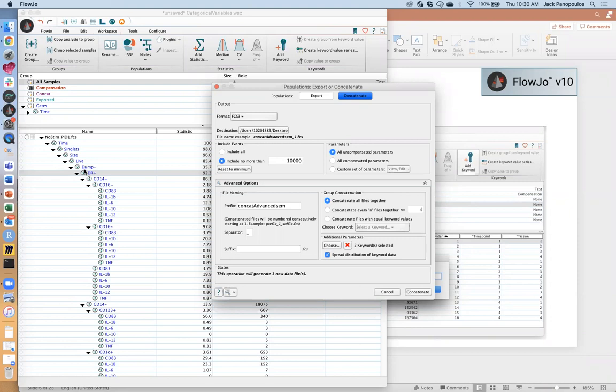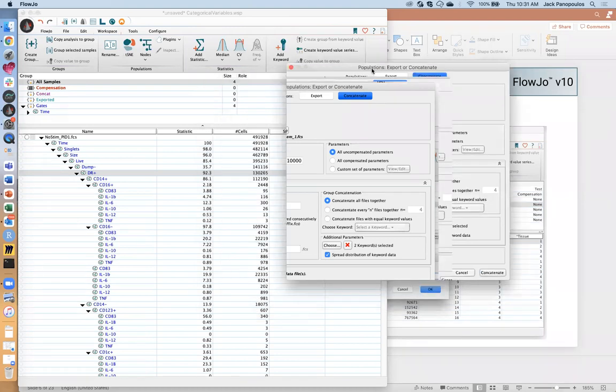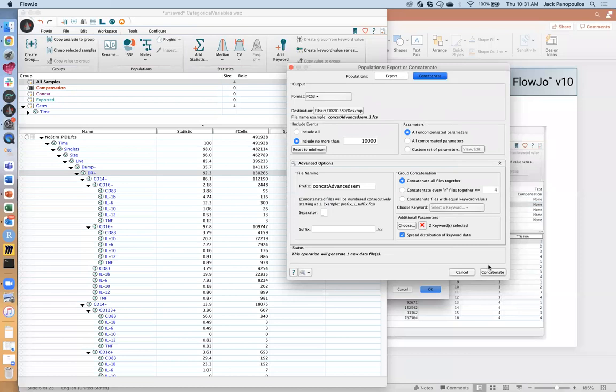So I don't know mathematically how that translates, but I know that it does have an impact here. And you will notice that difference if you do not transform and you have a lot of compact populations. Your t-SNE and your clustering results are not going to be super satisfactory. Or at least it's going to cause you to backgate a heck of a lot more than you would if you had transformed it.